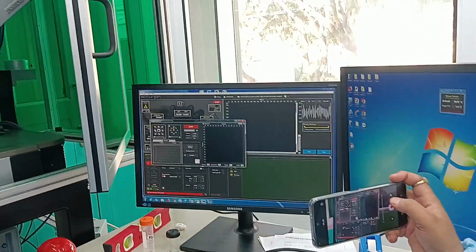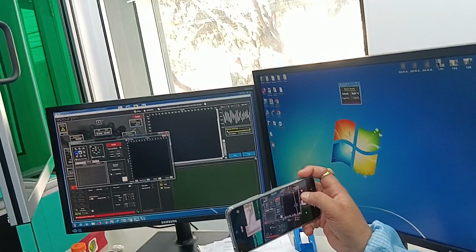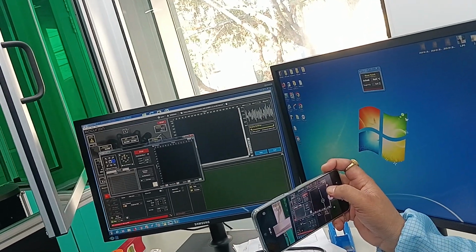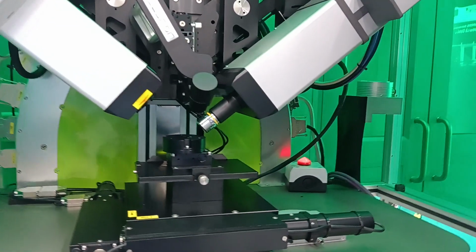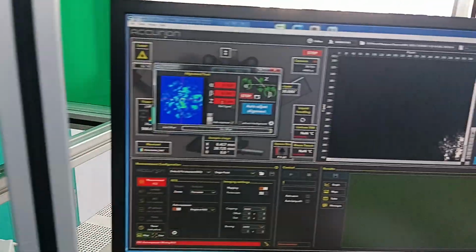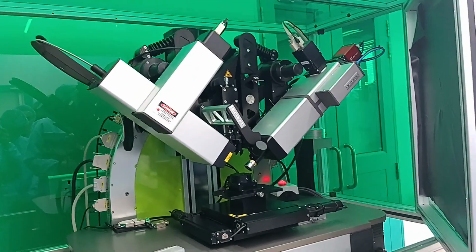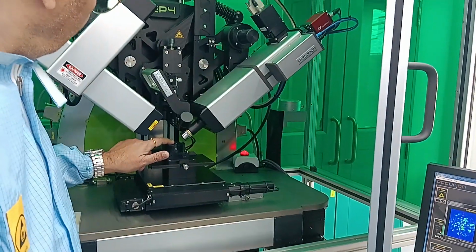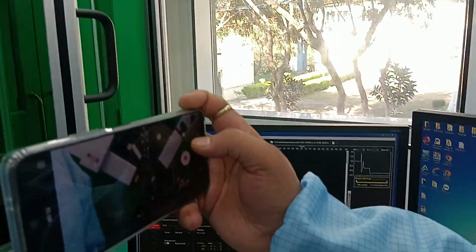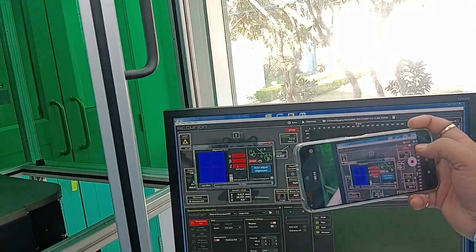Very simple, right? Oh, so it's moving the other way around. Sorry. Can you see? I can see. Yeah, that's the alignment. So that's the reason why that fellow is struggling. It is not able to align. If I just push my sample, you can see that it is changed.